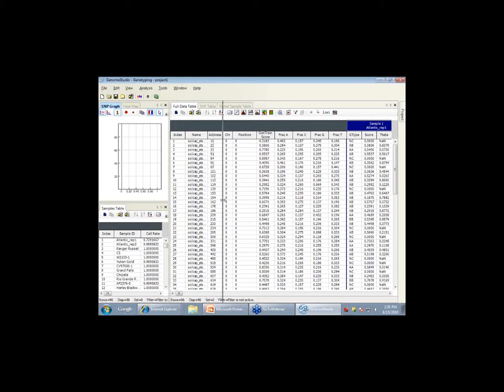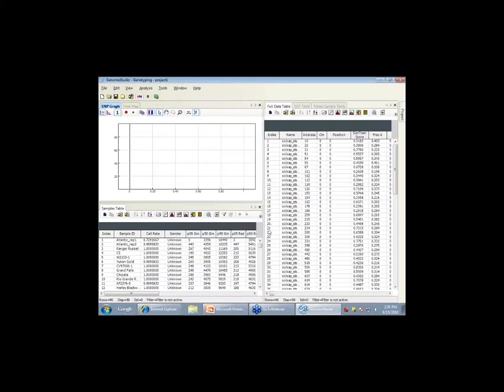The window that we like to see a lot is this one up here in the top left. We can make these windows as big or as small as we like. Something like this is a good way to work. If you want to see what windows are available, you can go down to the Windows menu and click and unclick different windows as you want. You notice there's 3 main windows, but there's more than 3 windows clicked here. Notice there's some tabs in these other windows, like the paired sample and the SNP table, which we're going to go to.